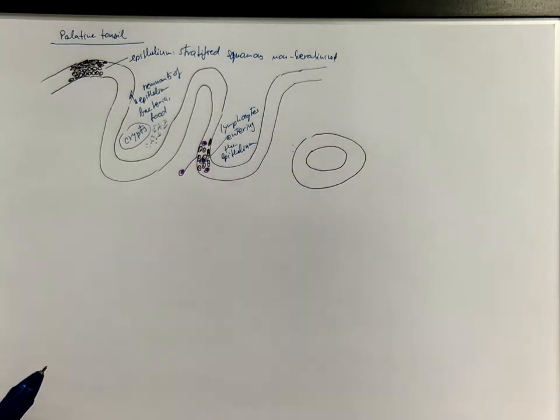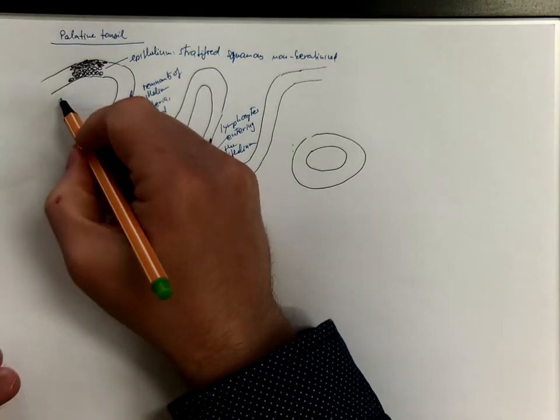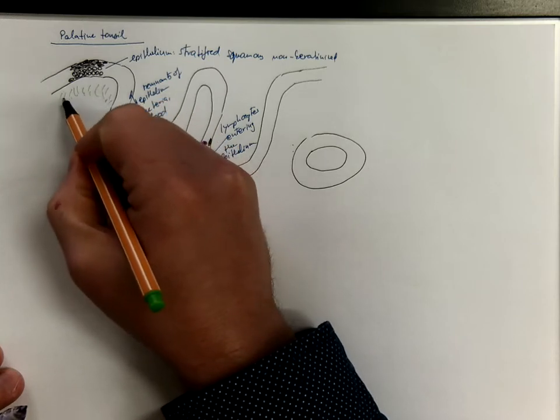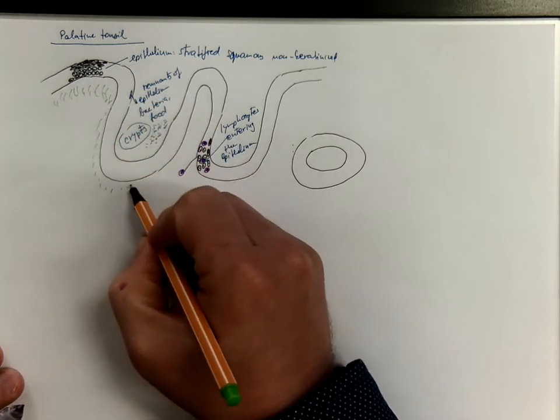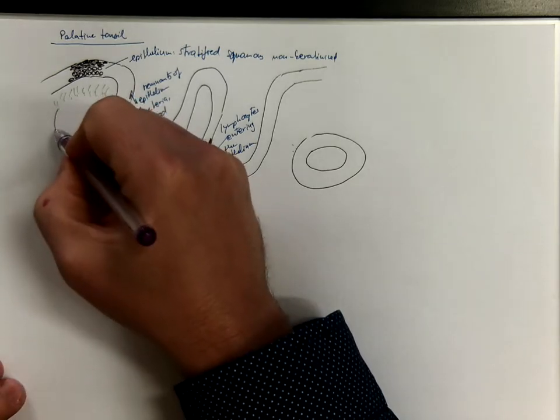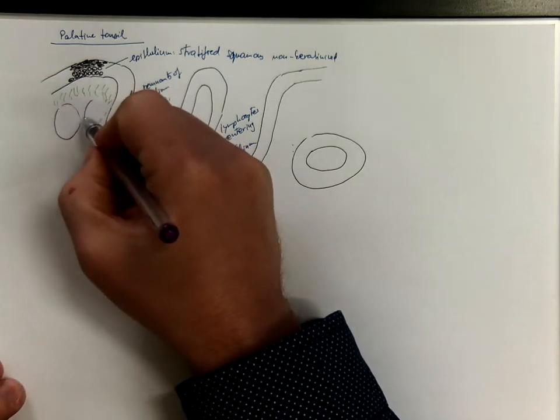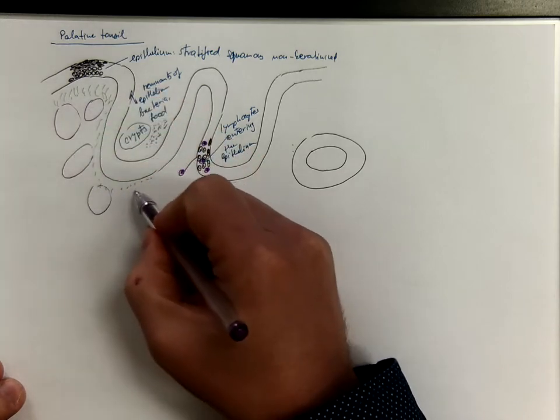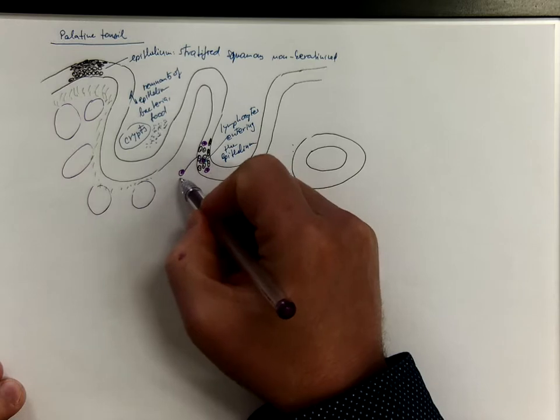And below the epithelium there is the lamina propria, made of loose collagenous connective tissue, mostly reticular connective tissue. But you can find accumulations of lymphocytes here. The so-called lymphoid follicles.